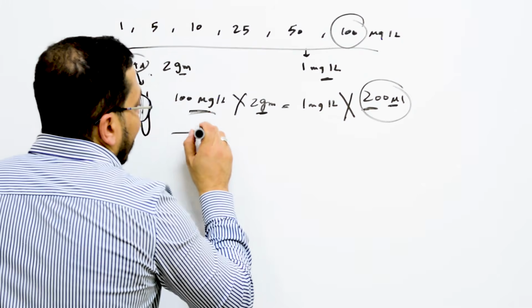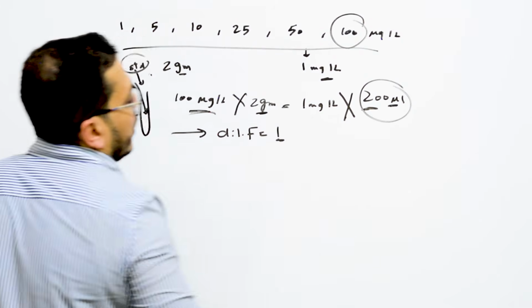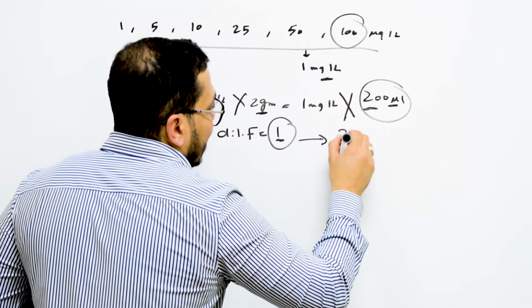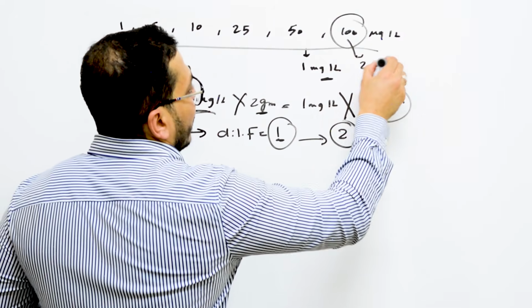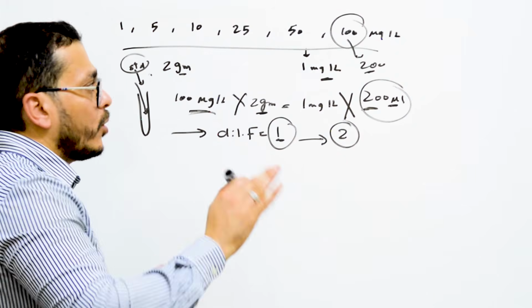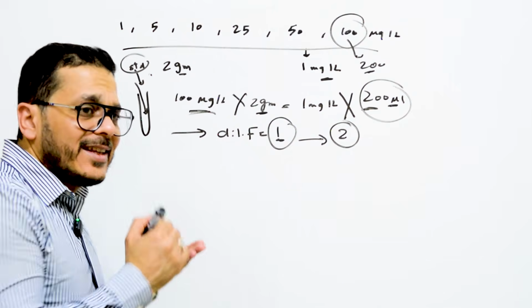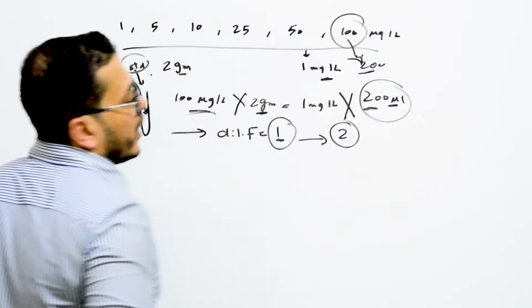That is in case the dilution factor in your method equals 1. But if the dilution factor for your method is, as an example, 2, then this 100 should be 200, because on the instrument it will be diluted 2 times and it will be 100. Or you can add this factor of 2 on the instrument, but it is better to prepare it from the beginning.